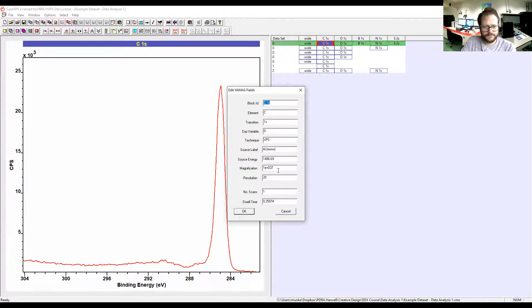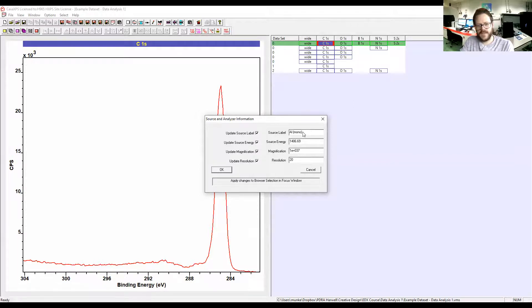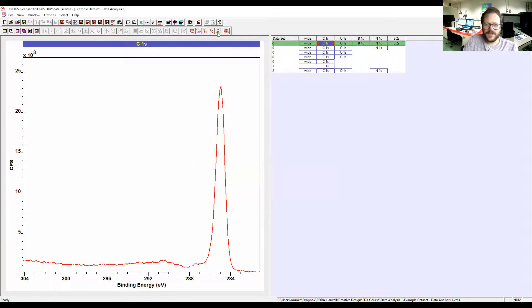If we click on our VAMAS block to open up some of these options, we can now click on X-ray Anode. This will tell you what X-ray anode was used. This is particularly important in terms of getting the right RSFs. The library files that we mentioned earlier will contain sensitivity factors for the different sources that are available. For example, on this system if we were to have an aluminum X-ray anode and a magnesium X-ray anode, if we were to change this source label to Mg and update that, it would then load the sensitivity factors for the magnesium anode. But I don't recommend you change any of the values in here, because you might forget why you changed them.